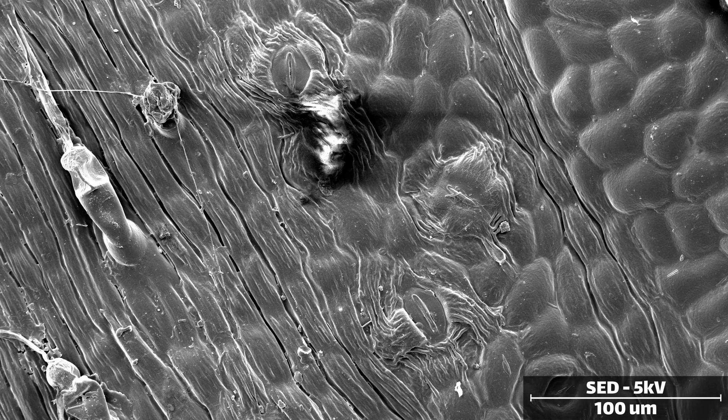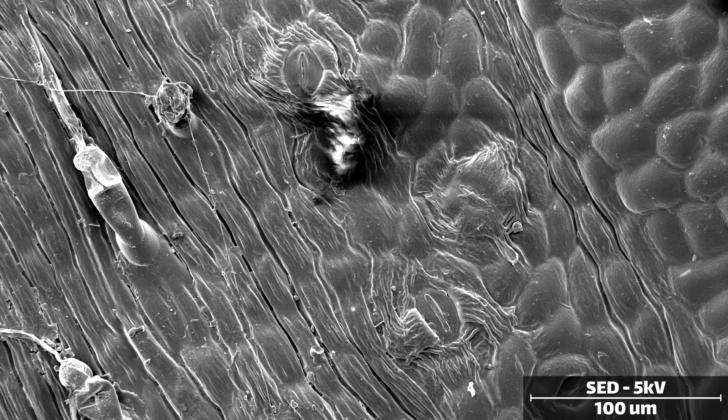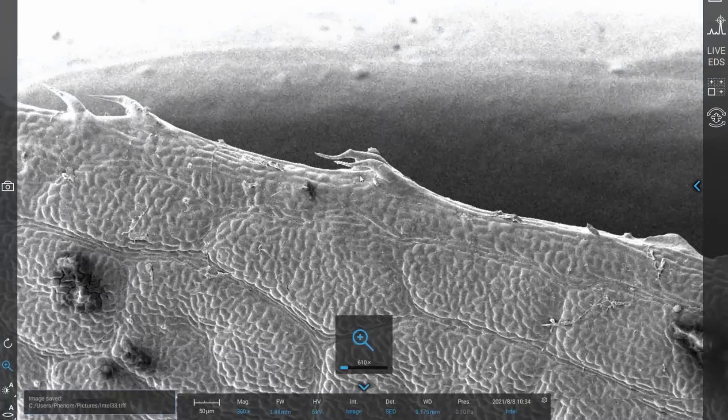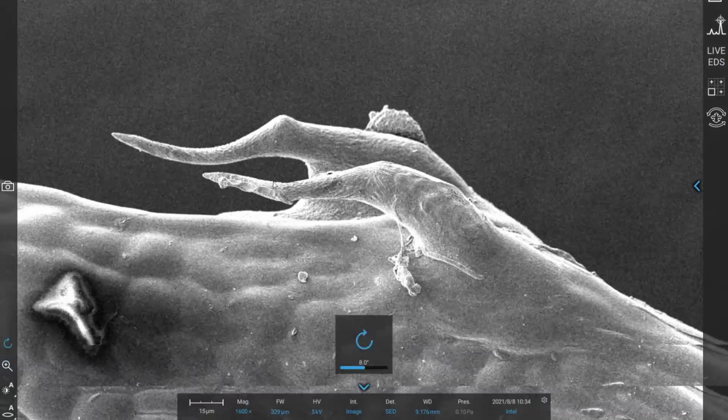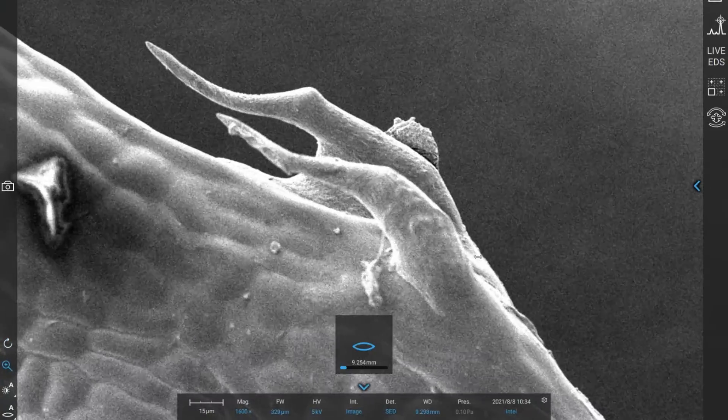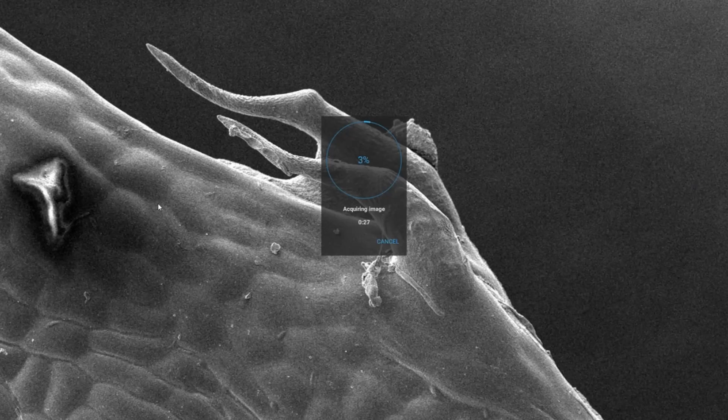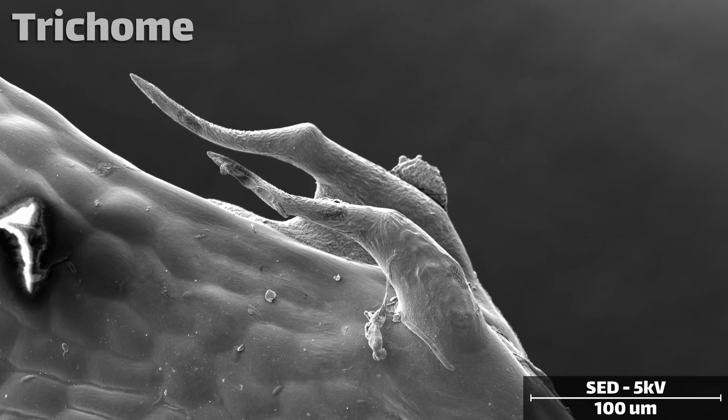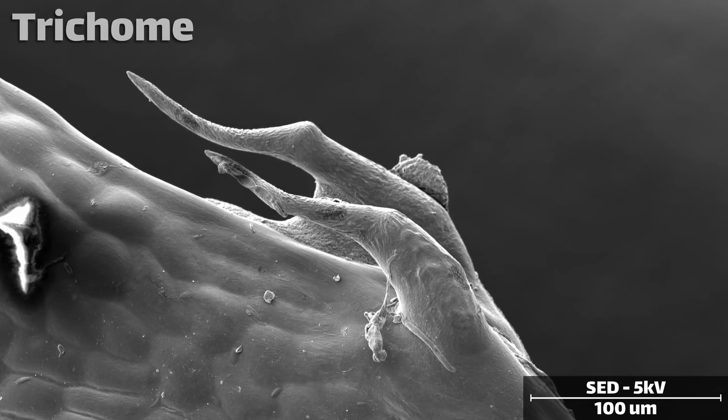Scattered around at intervals are small hairs called trichomes. Some trichomes secrete resins and substances which deter pests, while others help create a layer of stagnant air near the surface of the leaf to limit moisture loss. And some are just kind of pokey, to irritate wayward insects and encourage them to go elsewhere.